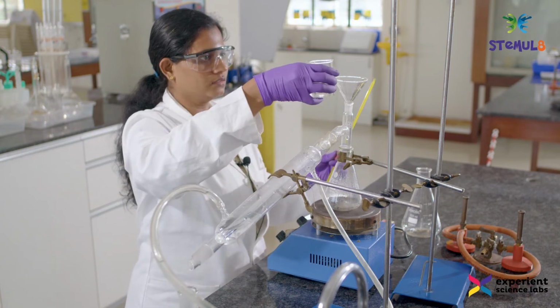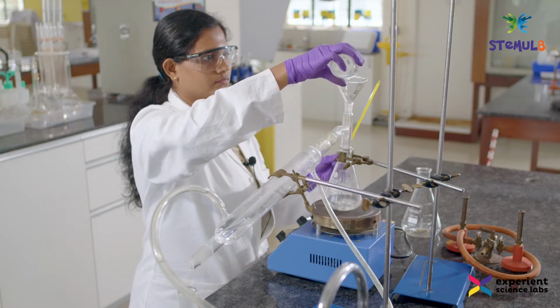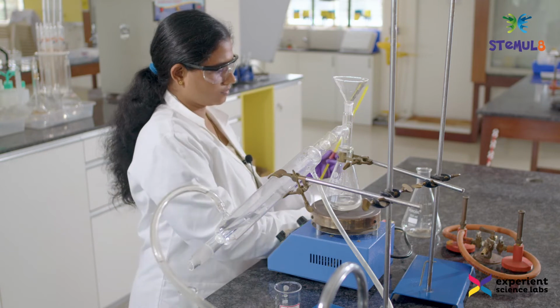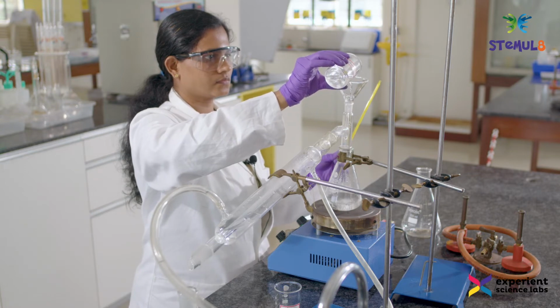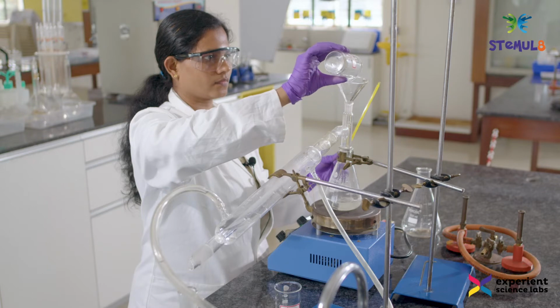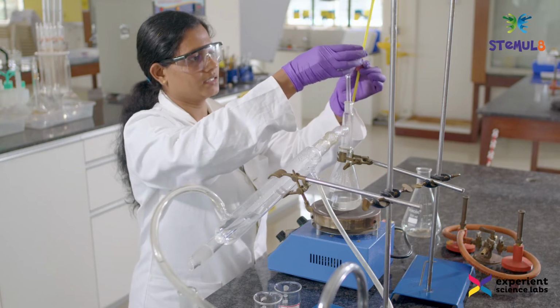This is water. This is ethanol. Place the thermometer back.